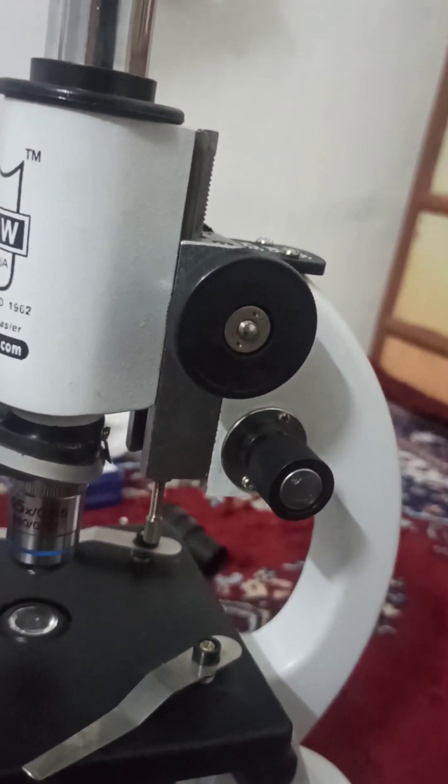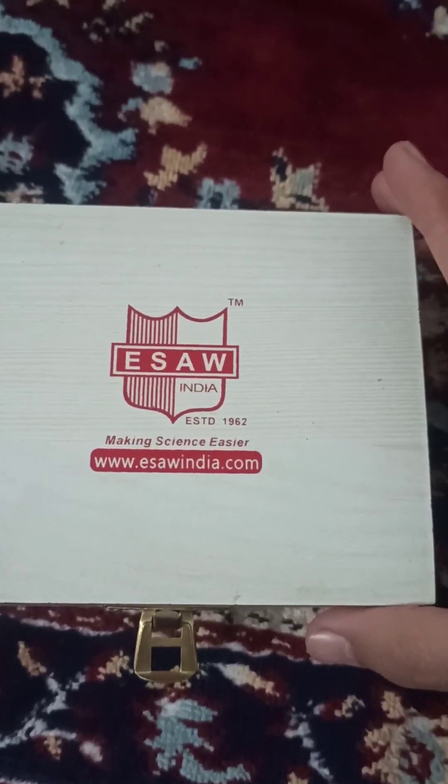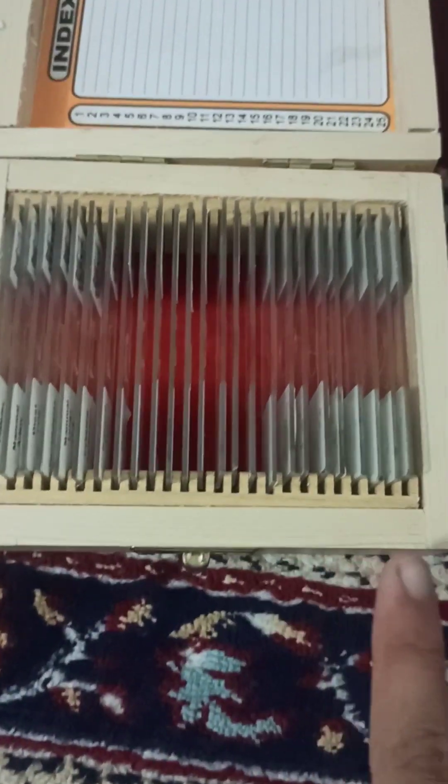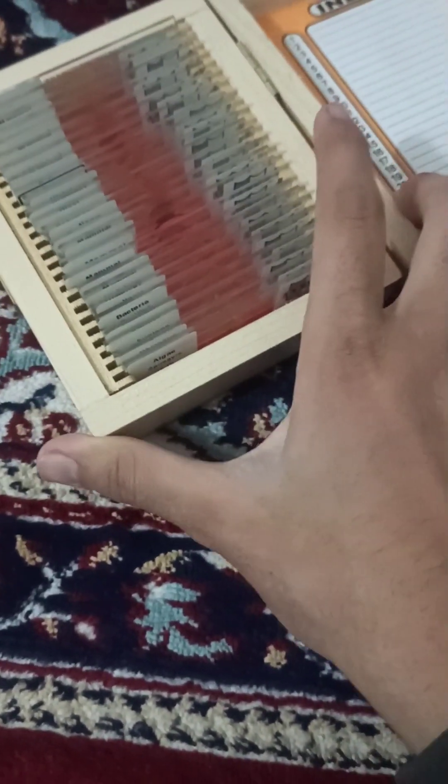The other knob is for finer movements. This is for fixation once you have reached the visible point for the slide. The pre-prepared slides that came in the box are 25 in number — you can also write names on them, and they are prepared very carefully.